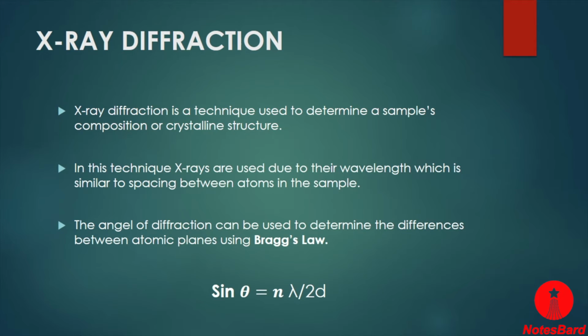The electrons surrounding the molecule diffract as the X-rays hit them. The beam of X-ray light hits the molecule, and this forms a pattern called the X-ray diffraction pattern, which is why the method is called X-ray diffraction.